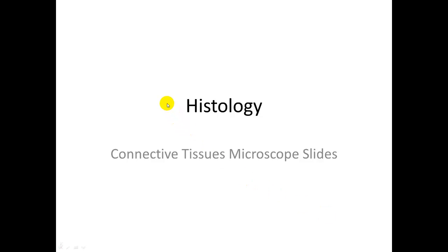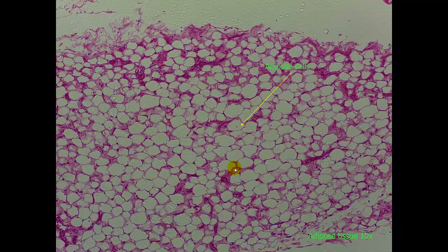Welcome to this lecture on histology. In this lecture I am going to cover the connective tissues. This is a microscope slide view. However, I will not cover much of the physiology. I will do that in a separate video. Please keep in mind that viewing these slides online does not take the place of actually going into the lab or obtaining access to a microscope to look at the tissues yourself. That is the best way to learn them. However, this is meant to be a supplement in case you don't have access to either of those.